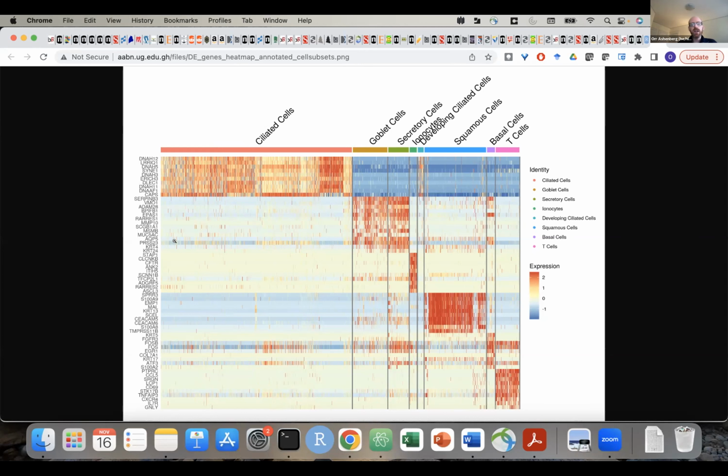If you've ever done bulk RNA sequencing, that is basically a pipeline, in that you almost never have to iterate. But with single cell, it's pretty common to look and go back and tweak things or try really different things. So this is why it's also much more fun and interesting and exciting.